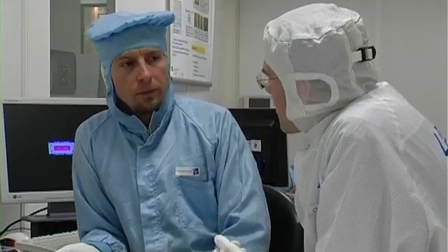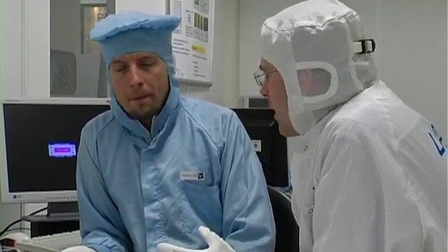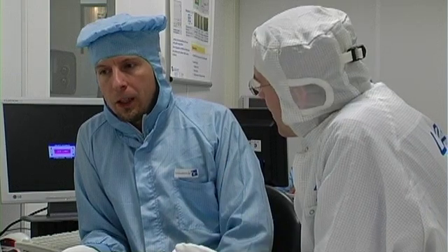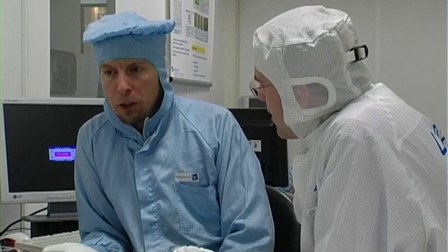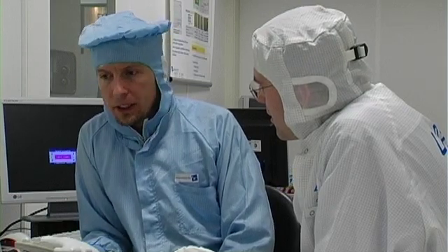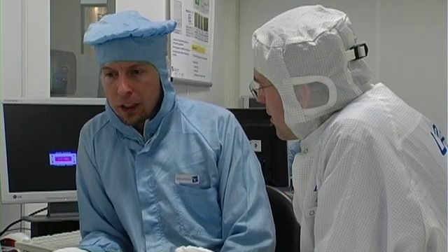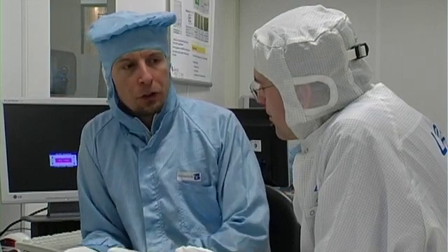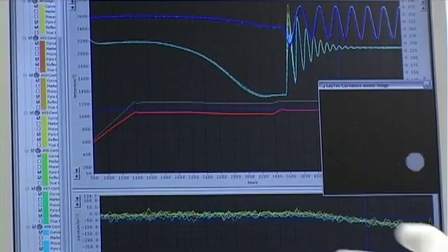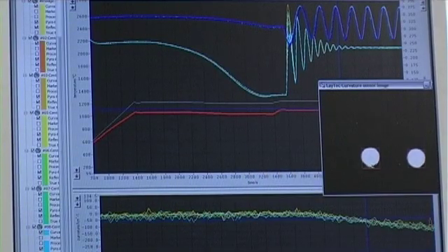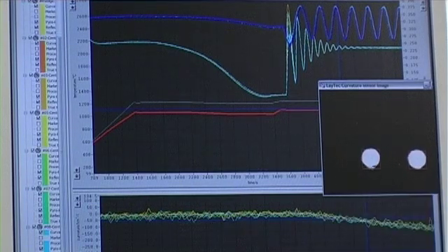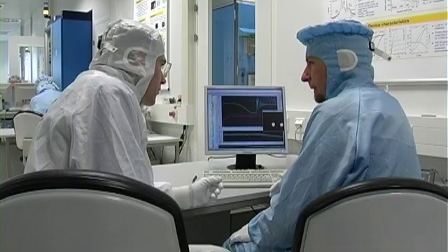Just imagine you wouldn't have any LaTeX instruments in your reactor. How would this procedure look like? Well, for most of our growth development, development of epitaxial layers, we would need a much longer time. So, we can actually see some things during the growth, which cannot really be measured after the growth of the whole structure. For example, we see here the aluminum nitride. There is actually no change in curvature. Just here, during gallium nitride growth, the curvature changes. This layer is strained.